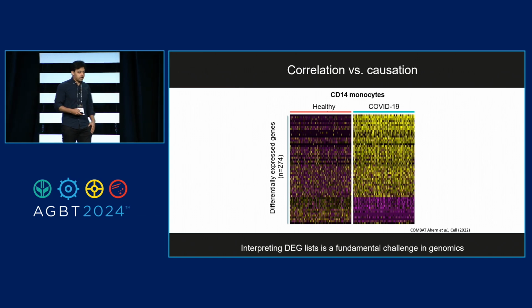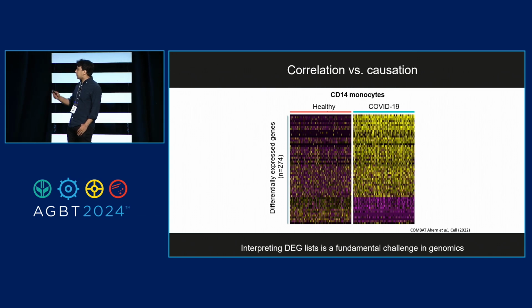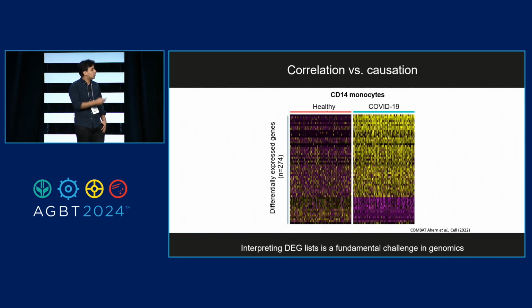This is an output of a single-cell RNA-seq experiment. You've all seen heat maps like this. We can look at a per-cell resolution and understand detailed molecular signatures of genes which change between health and disease. We have incredible resolution to be able to do that with functional genomics. What's hard is, what do we do after this? How do we go from this sort of observational, correlation-based data towards a more causal and regulatory understanding? How do we know what drives these particular types of changes?